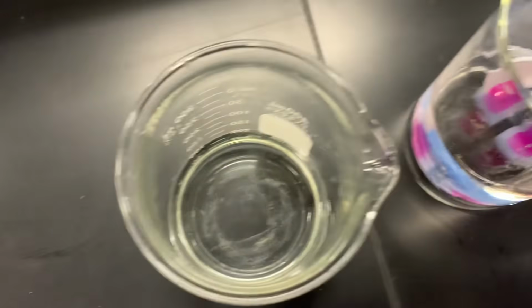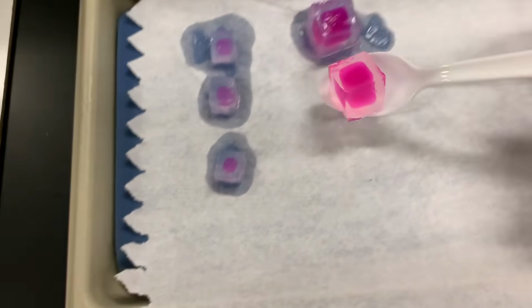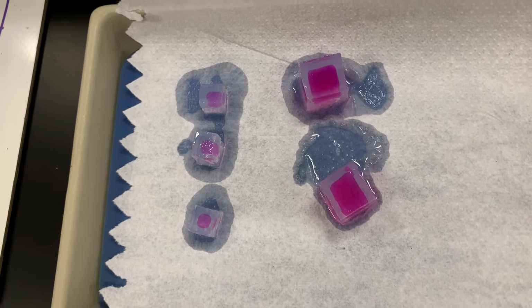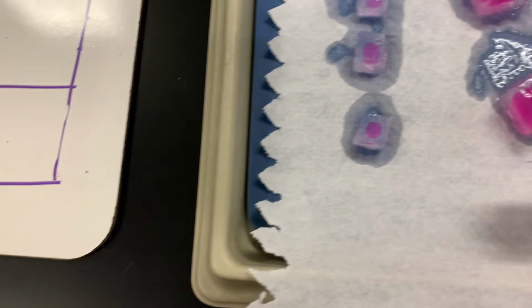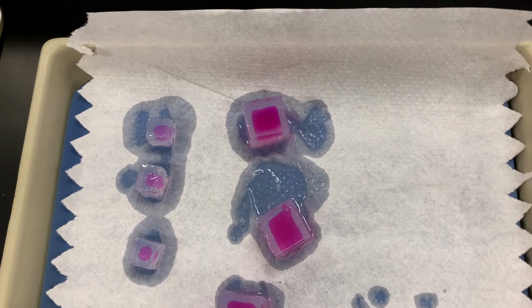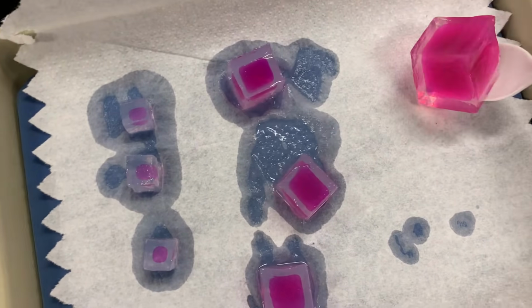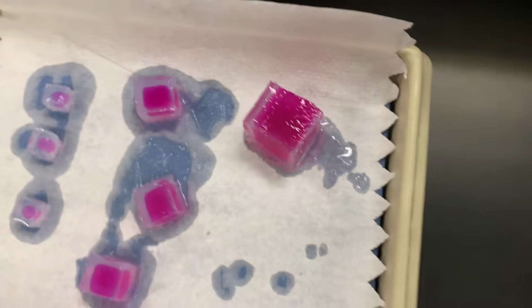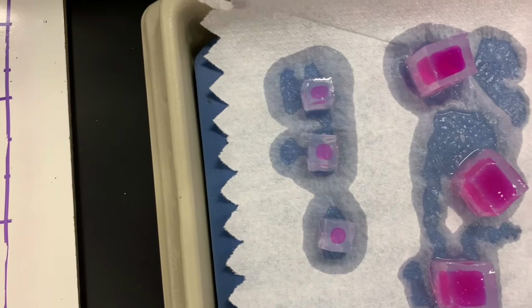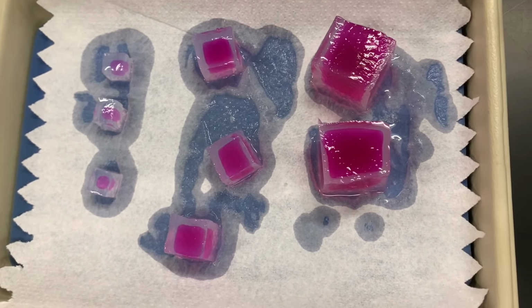I'm just going to let them dry for a minute or two. The only part about using the dissection tray that is a little less than advantageous to us is that the paper towel becomes translucent because the hydrochloric acid goes on there, so it's a little more difficult to see the pink. So I'm going to let these dry for a minute, and then once they dry, I'm going to transfer them.